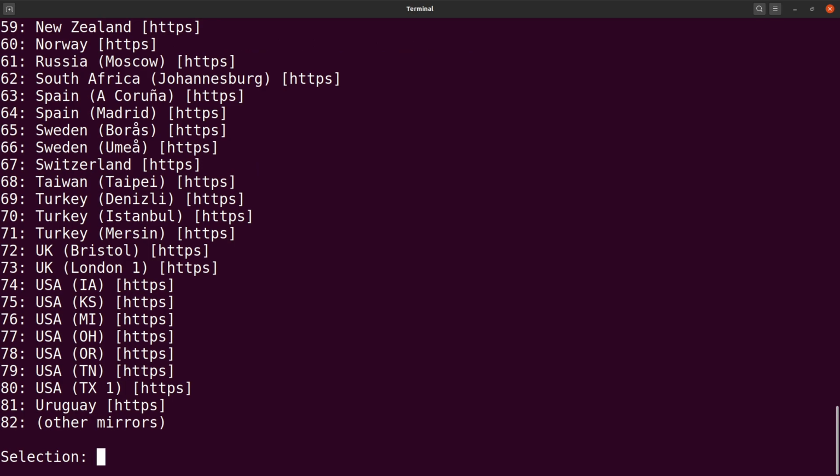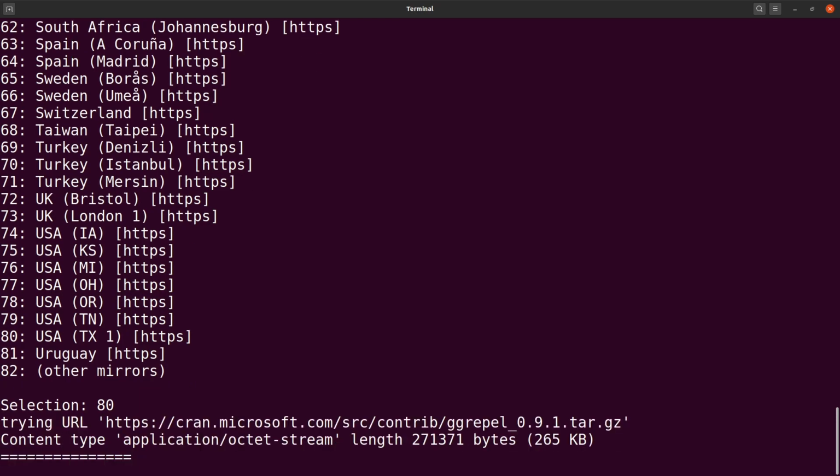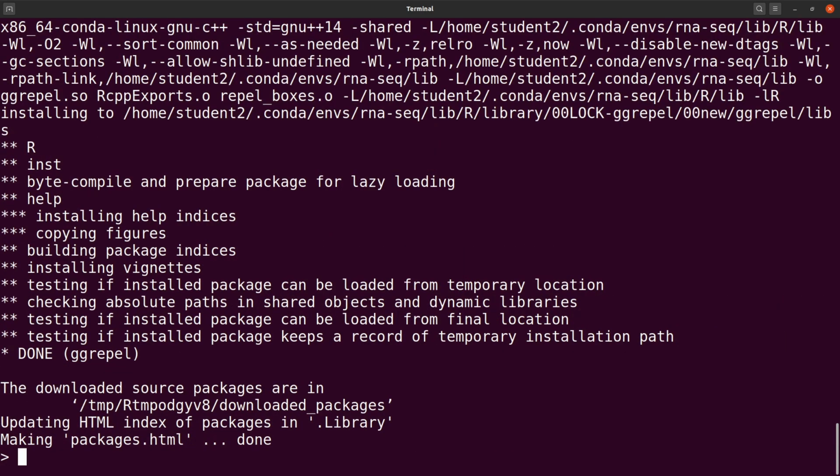So here we are being asked to specify a CRAN repository. I'll just choose, let's say, 80. Yeah, let's use 80, and then let's select it. After that, installation will proceed. Okay, that package has also been installed. So we are ready to go.